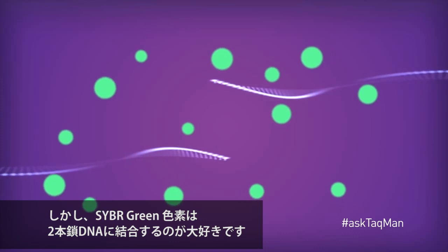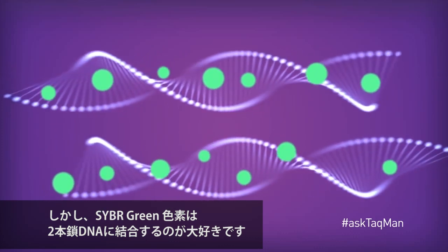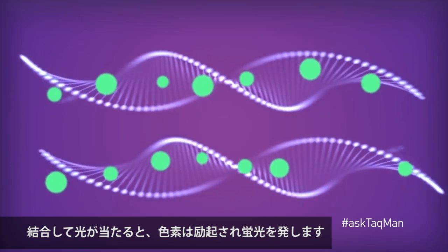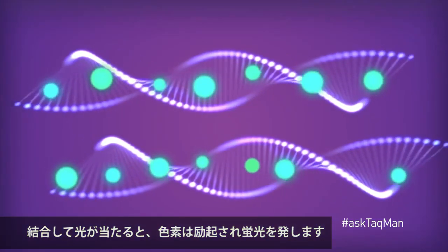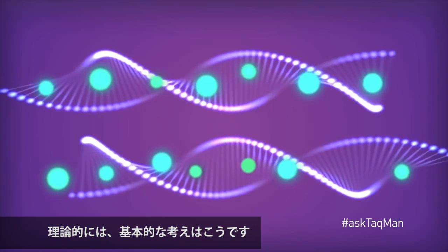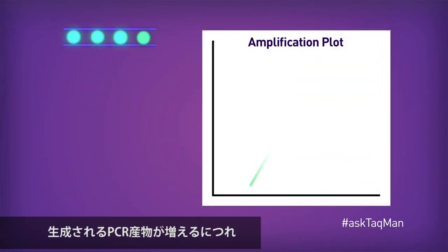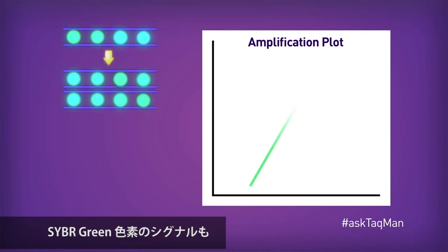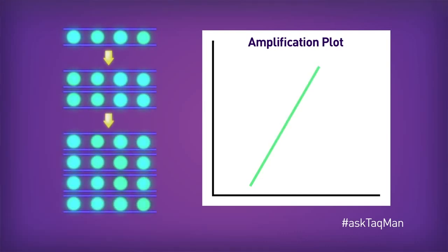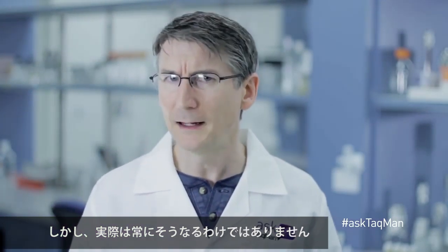SYBR Green dye really likes to bind to double-stranded DNA, and when it does and you hit it with light, the dye gets excited and fluoresces. At least in theory, the basic idea is that as PCR creates more and more product, the signal of SYBR Green dye goes up proportionally. In practice, though, this doesn't always happen.